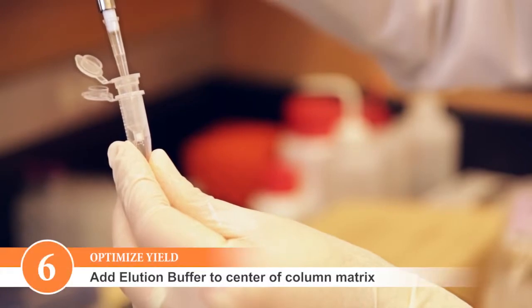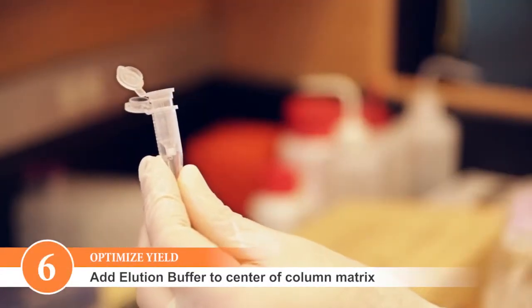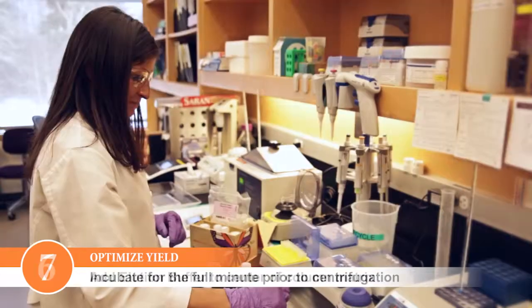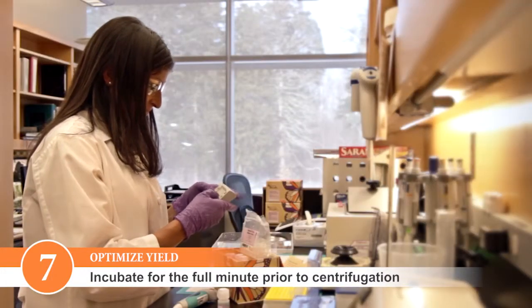Ensure that you add the elution buffer to the center of the matrix without puncturing it. The elution buffer needs to be in contact with the column matrix for efficient elution. Be sure to incubate the elution buffer in the column for the full minute before centrifugation.